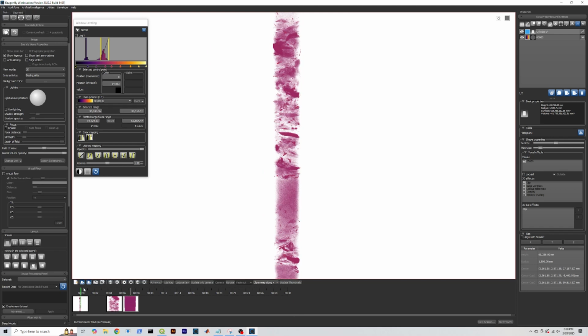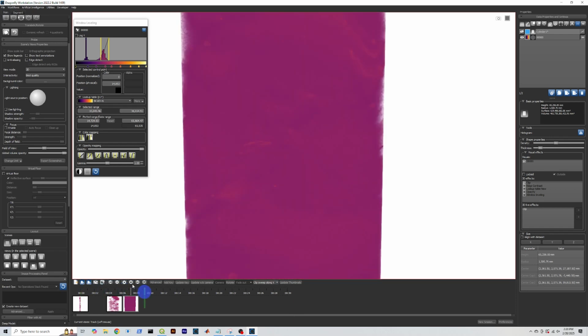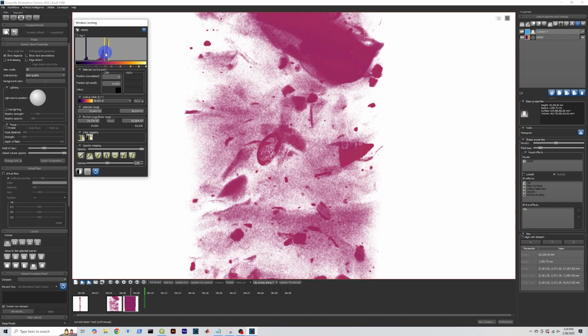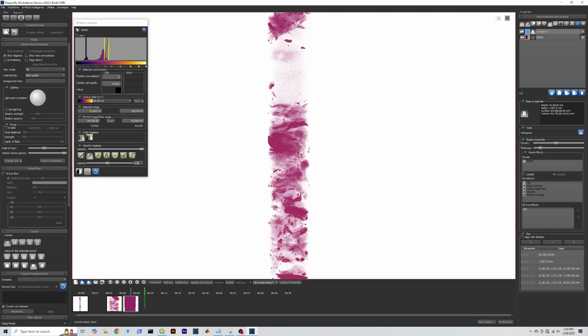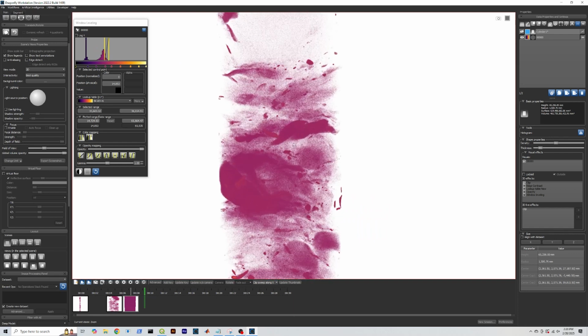And let's go here. And let's change that to a more useful color mapping again. Let's go back. Yeah, let's go back to that. Zoom to a new place in the core. Okay, and then let's add that key again. And then you can also add a rotation keyframe.